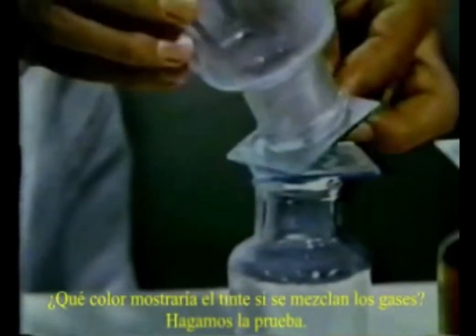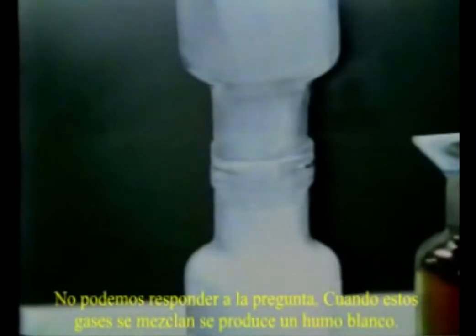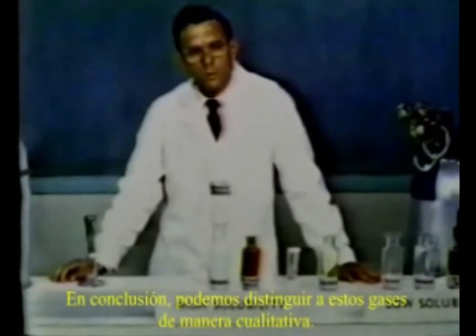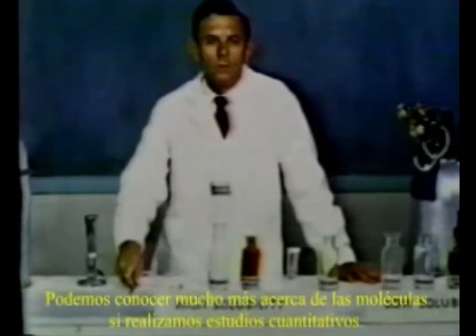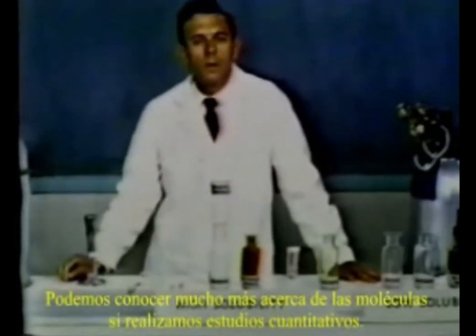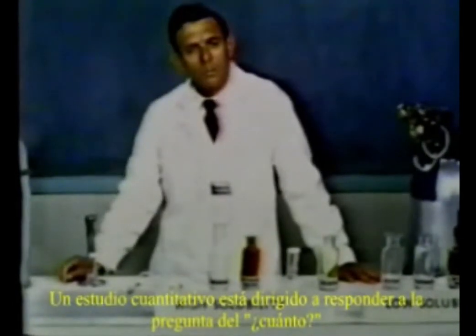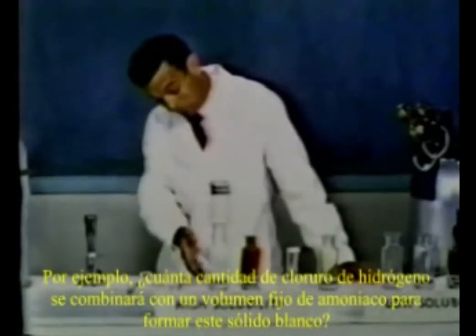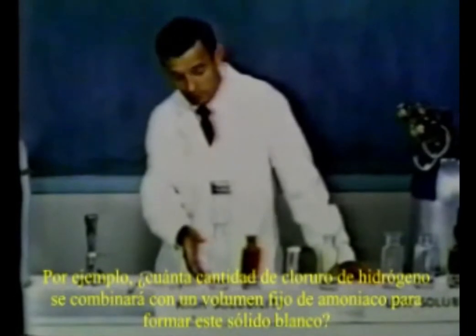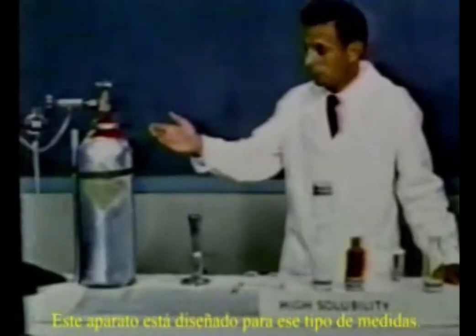What color would the dye be if the gases are mixed? Let's try it. Oh, we can't answer that. When these gases are mixed, we get a white smoke. So we can distinguish these gases qualitatively. We can learn much more about molecules by making quantitative studies. A quantitative study is concerned with the question, how much? For example, how much hydrogen chloride gas will combine with a fixed volume of ammonia gas to form this white solid. This apparatus is suited to such a measurement.